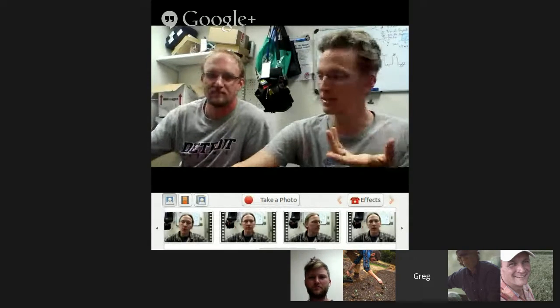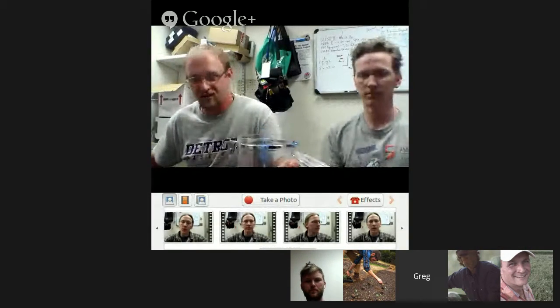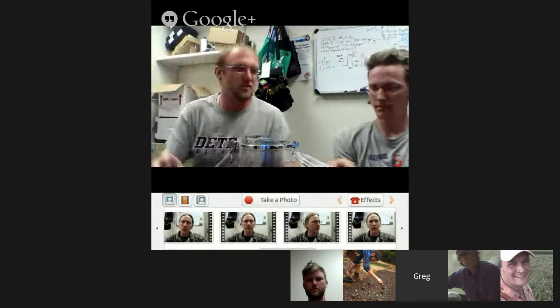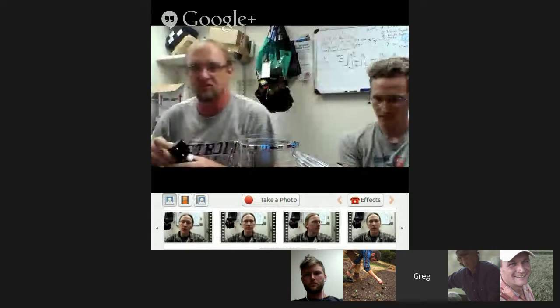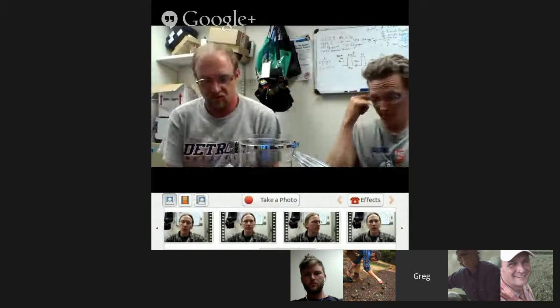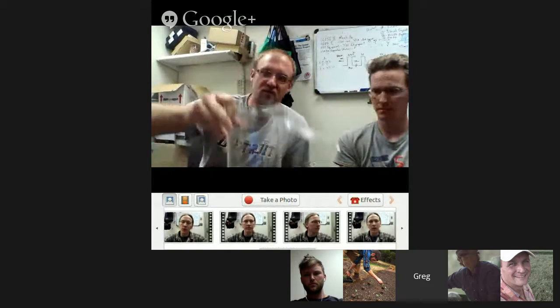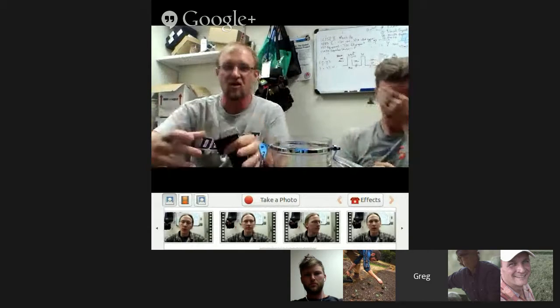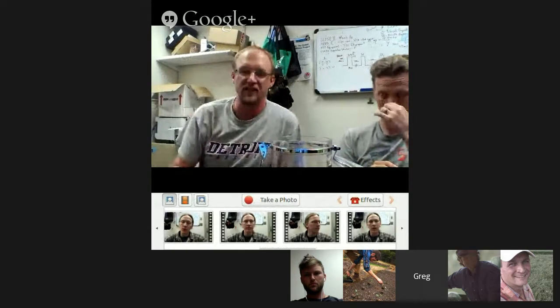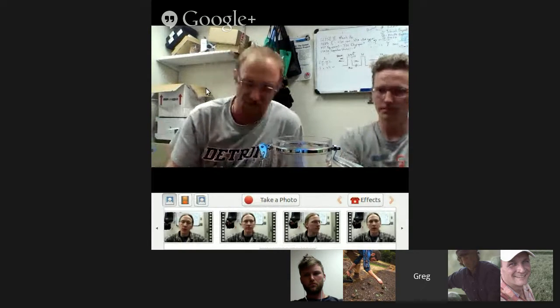So now Dan's going to talk about some soil applications. Great. Yeah. I will use the mobile app just because it's easier to do. This device generally connects to an Android phone with Bluetooth. I'll show you a little bit what we do with soils here. Normally we have a canister that we can put in situ in the field, and then you can get biological activity curves, so CO2 flux curves right in the field.